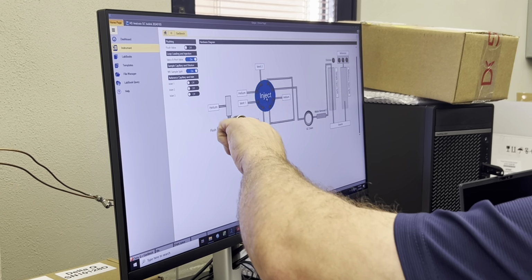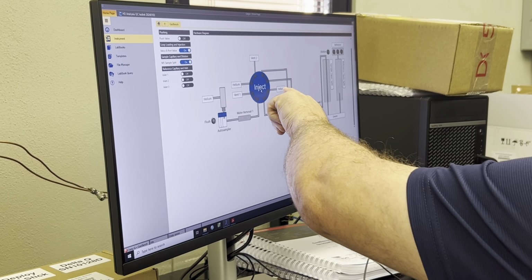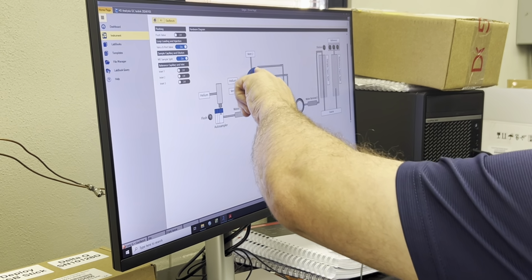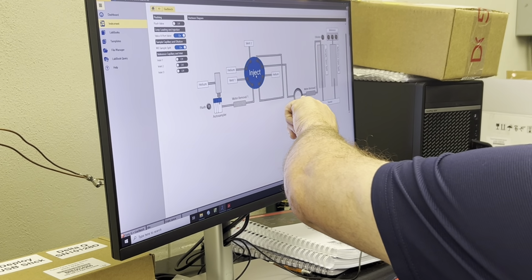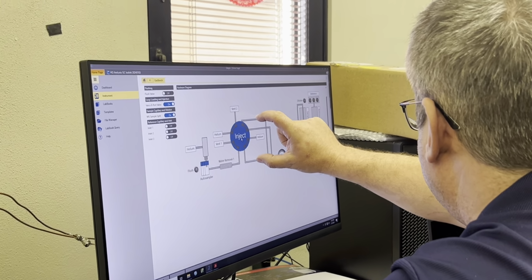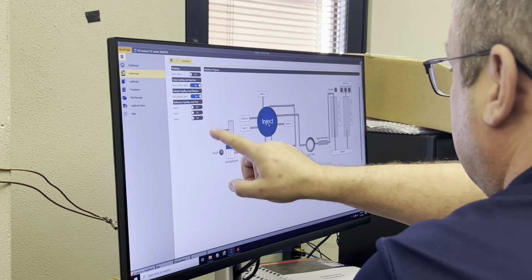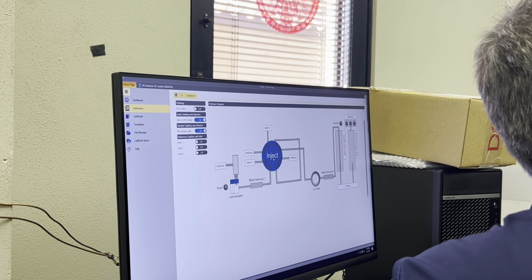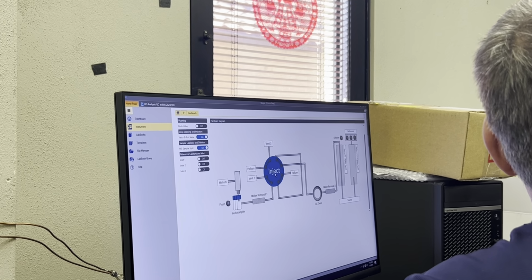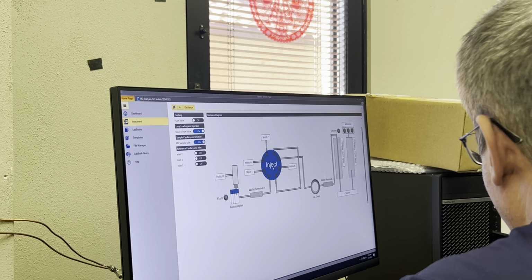So the helium flow from here now just goes to vent, but the helium flow from here now actually goes back into the loop and then flushes it towards the GC column. You've got a 100 microliter loop there, so that's filled with the mixture that comes from here. The sample gas is split. Part goes to here, part just vents.